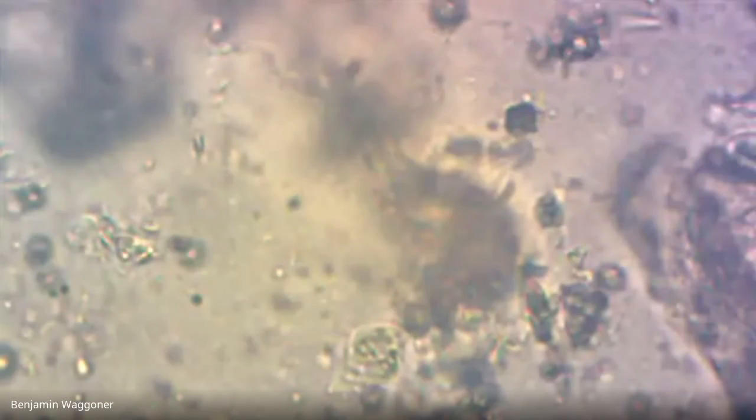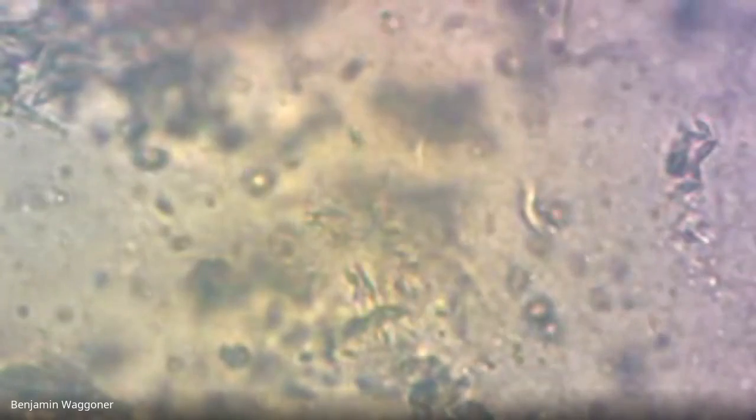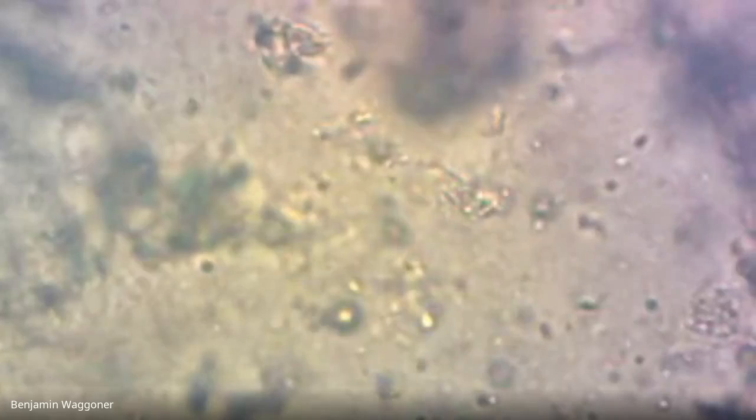A little bit. But okay, no sooner did I cut off than I broke that wood a little bit more, and I actually did manage to find a termite. I finally pulled off the right part of the bark that actually led me to where they are, and I squished out the guts of a soldier termite.